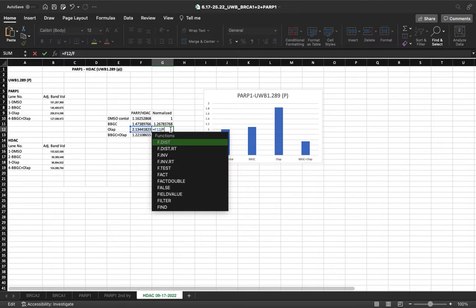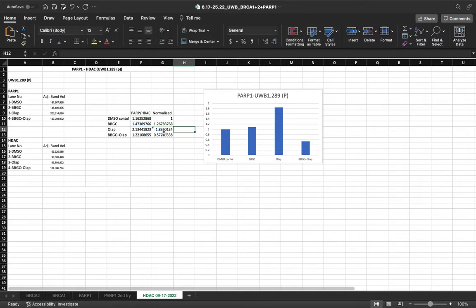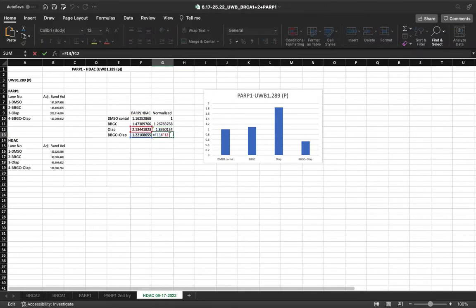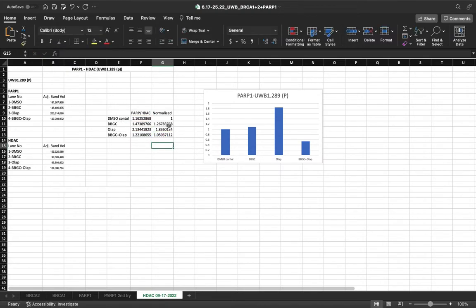It should be the Olaparib over the DMSO control, just like that. Let's make sure that this is correct. It is not. Again, the BBGC and Olaparib over the DMSO control. Great.